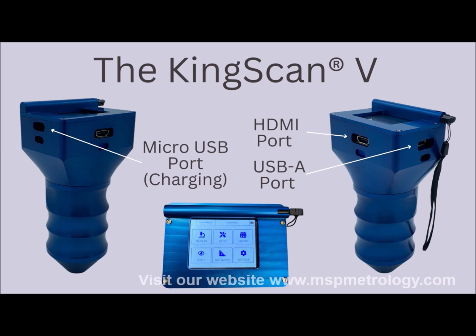On top of the unit there's a holder for the stylus and push buttons on the side. The stylus is used to navigate the screen and capture images. Additionally, the KingScan 5 has Wi-Fi connectivity which will be seen in the settings.